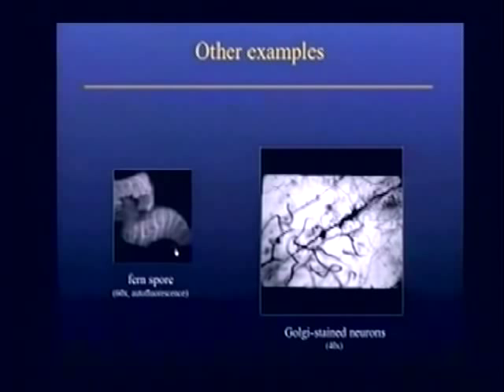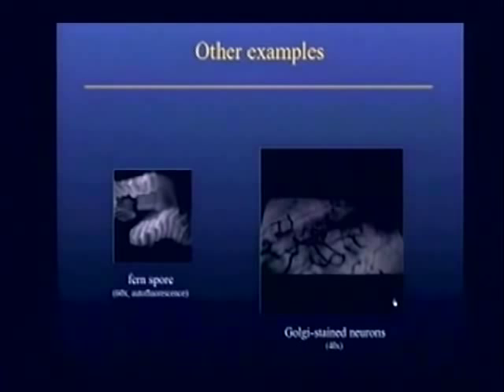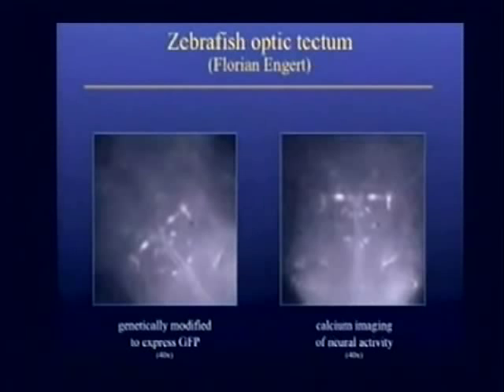The one on the right is a bit more scientifically interesting. These are Golgi stain neurons. It's a staining procedure that will make opaque a very small fraction of the neurons in a tissue, so they'll turn them black, and that's what you see here. And this is a single photograph that we're rotating digitally. Look at the amount of parallax on this capillary here. This is one of those objectives that captures from negative to positive 70 degrees, so it's 140 degrees of parallax that we're seeing here. This suggests there might be applications in neuroscience, and several of my collaborations are along those lines.